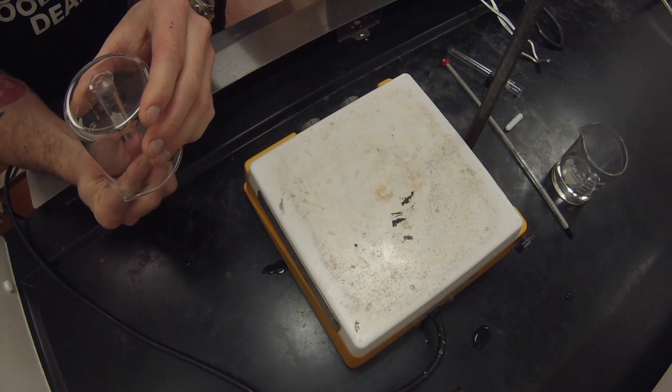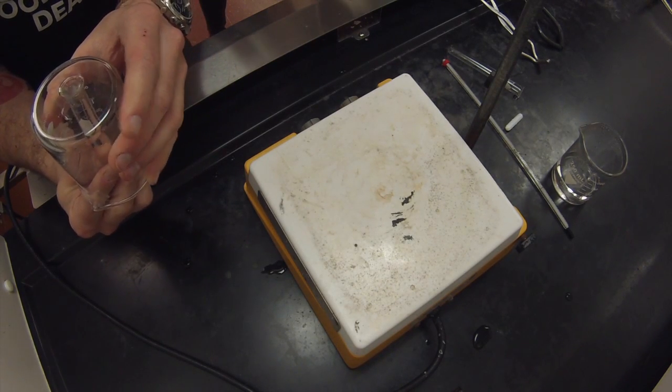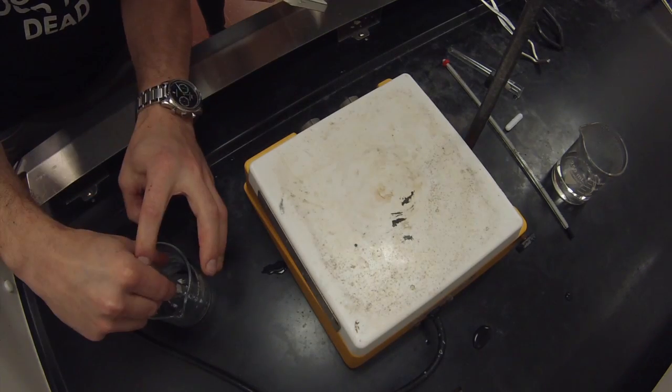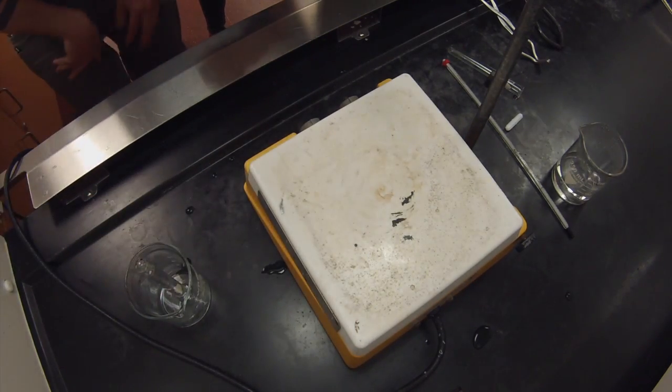Next, place a beaker over the test tube and very quickly invert both the test tube and the beaker. Again, try to prevent any water from leaking out. Afterwards, your setup should look something like this.